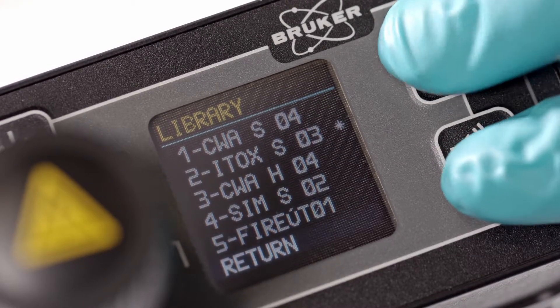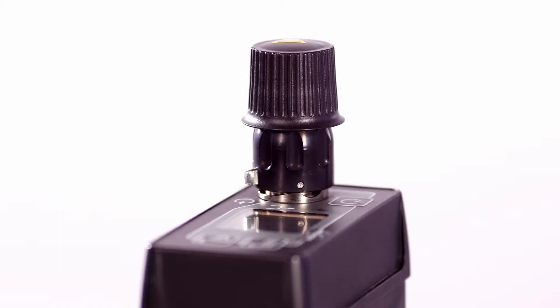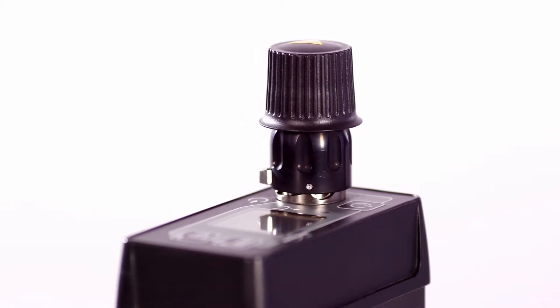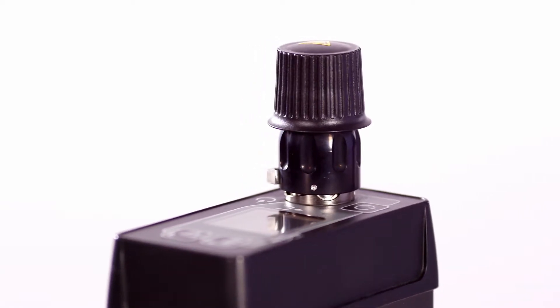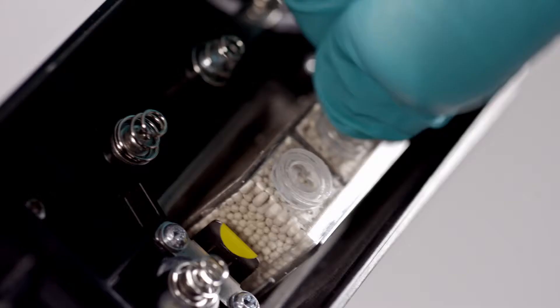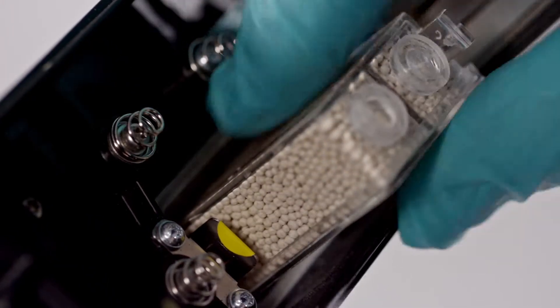The instrument can be supplied with a standard configuration or custom-to-user requirements. A separate pollution alarm can also be activated.